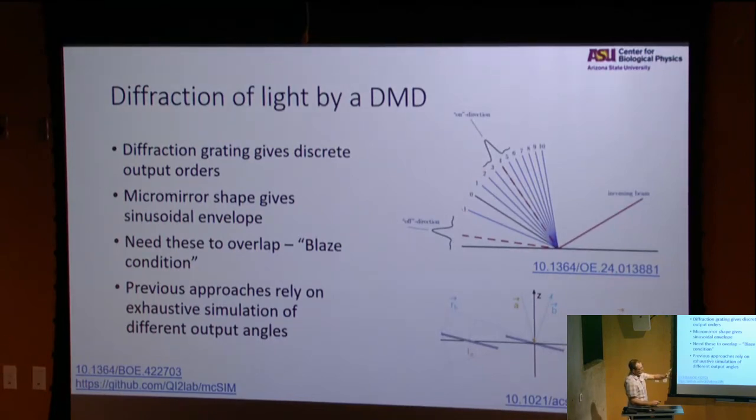And then the thing is, we can actually tell you what it should look like at the camera, which means now we have a complete model of the system, right? So we have this forward model that completely specifies how these patterns should show up when you end up back at the camera. Let's say you're imaging just a uniform dye slide, right? Then you should see this.